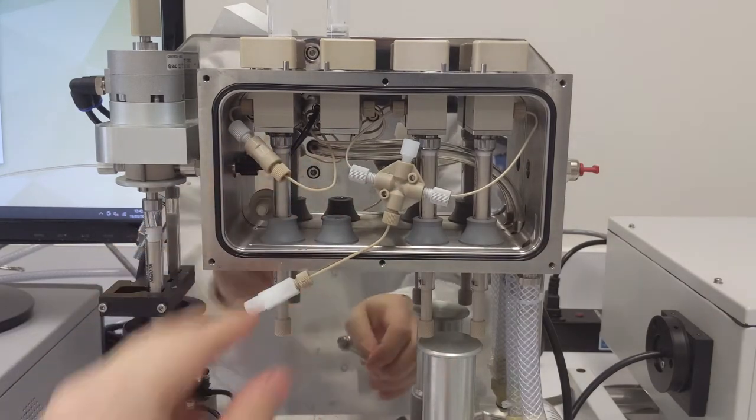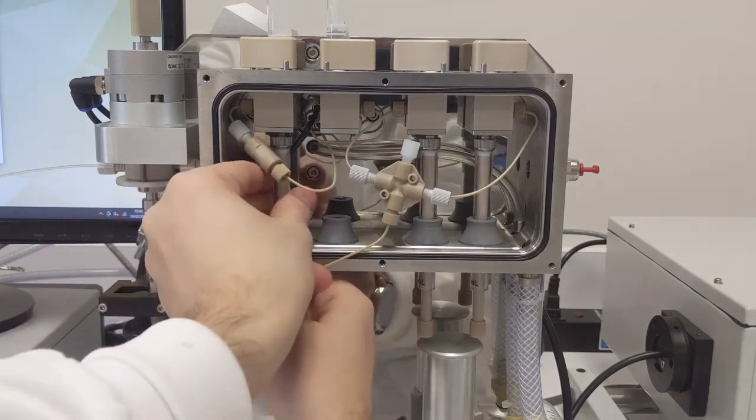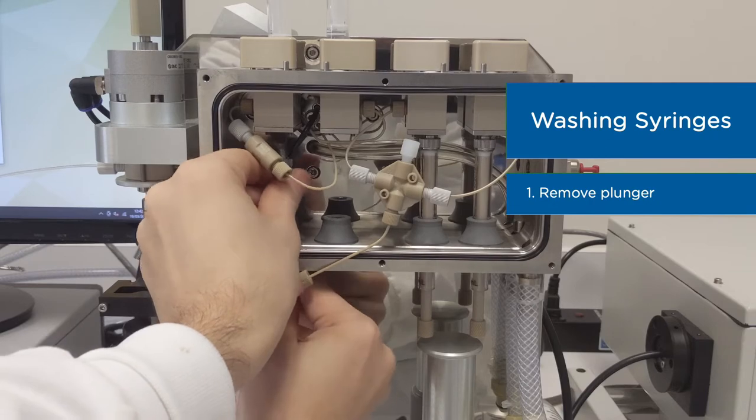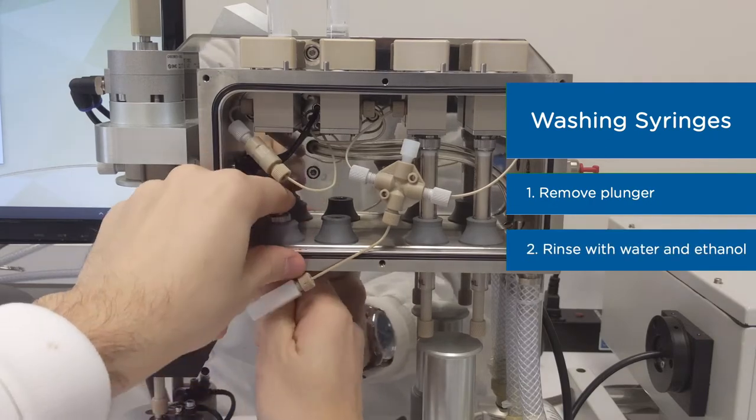Syringes are typically removed for cleaning, especially if you observe some dirt or particulates during your experimental run. Removing the plunger and washing the inside of syringe with water and ethanol can be very helpful in this case.